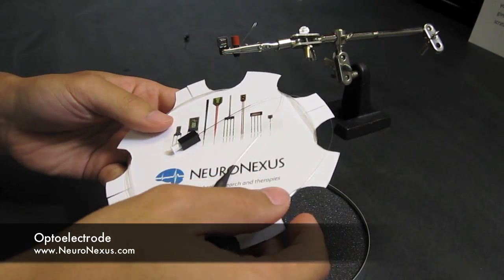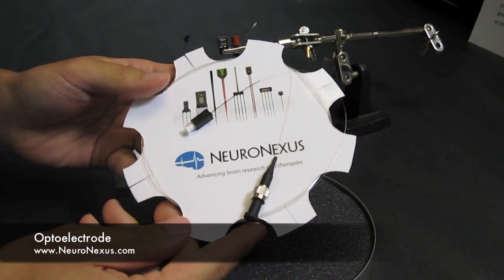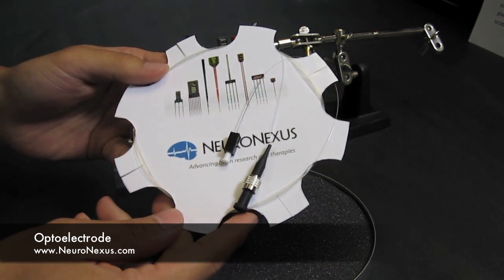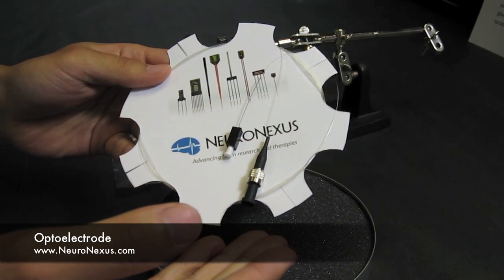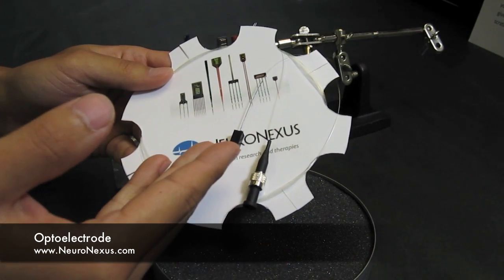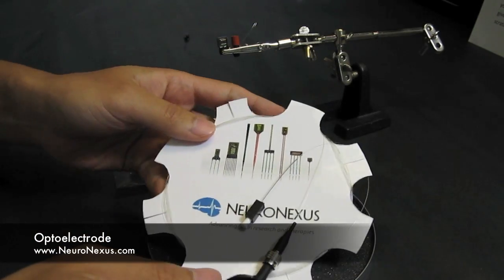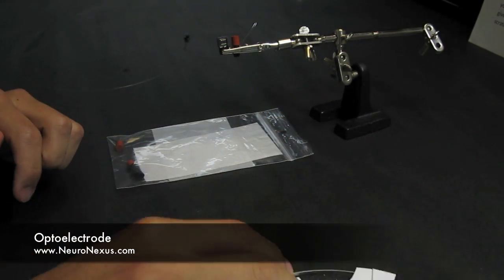This third product is the patch cord that we sell to mate with chronic optoelectrode. This particular one has an SMA connector and our custom coupler. Notice that each component comes with a cap.